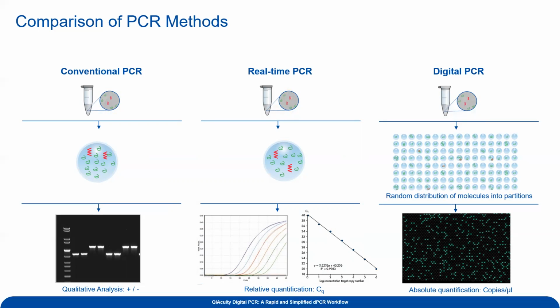So in the 90s, real-time qPCR came around, and this again is really the same fundamental reaction components as what you use in your conventional PCR. So you have the primers, you have your polymerase, you have your buffer, you put your starting template in. But now the major difference is within this reaction mixture, we have fluorogenic molecules. So either things like TaqMan or hydrolysis probes, which when they're cleaved are going to give you fluorescence back that you can read from your qPCR system.